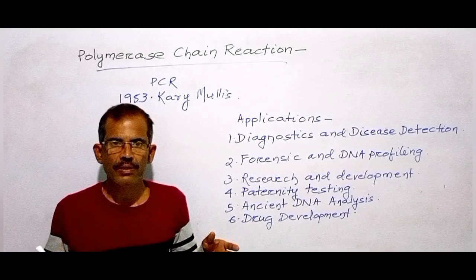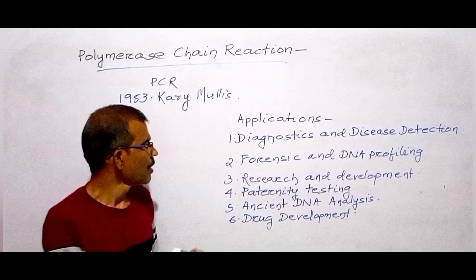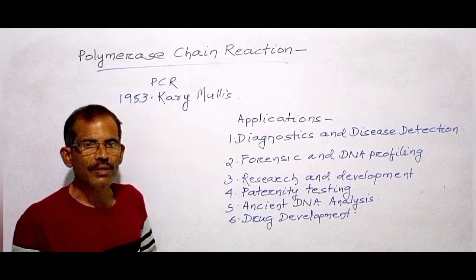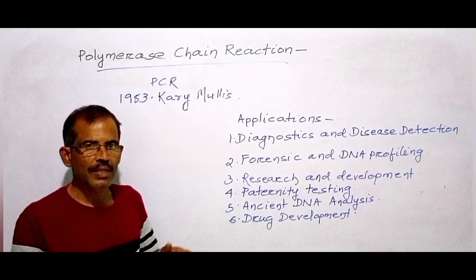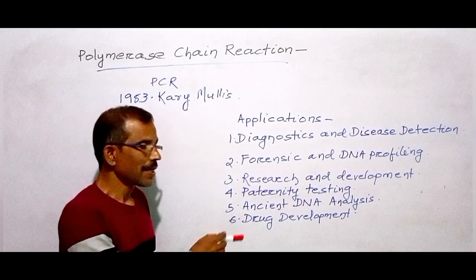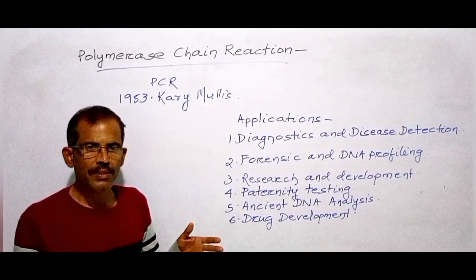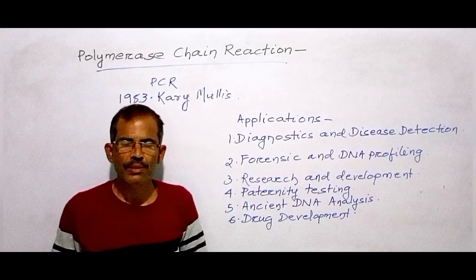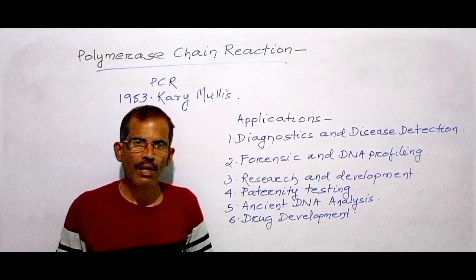Polymerase chain reaction has several applications including diagnostics and disease detection, forensic and DNA profiling, research and development, paternity testing, ancient DNA analysis and drug development. So friends, this is all about standard or conventional PCR.